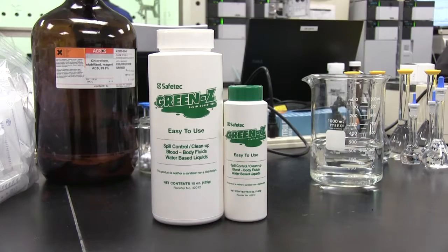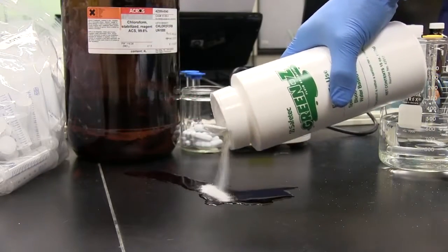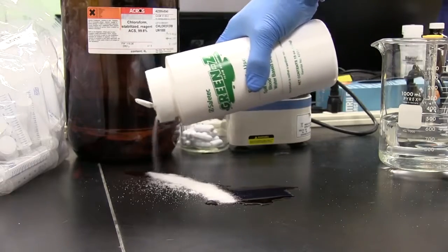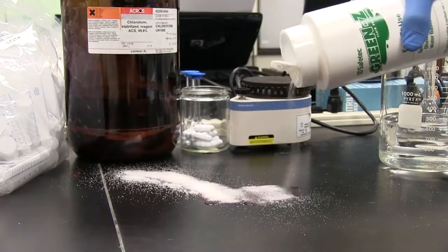Once a blood, bodily fluid, or chemical spill occurs, sprinkle the Green Z powder to first surround the spill and then evenly distribute over the contained fluid while wearing the appropriate protective clothing.